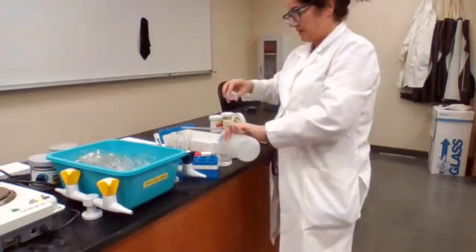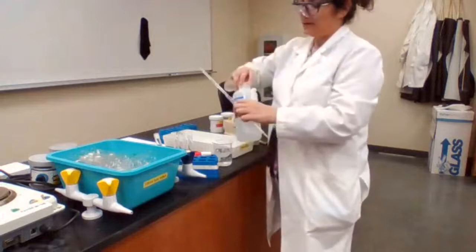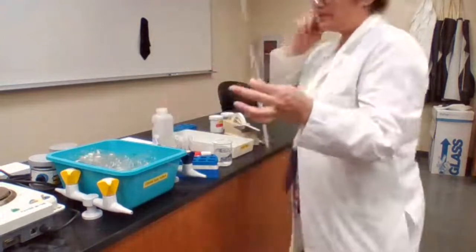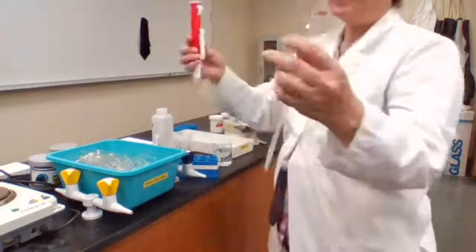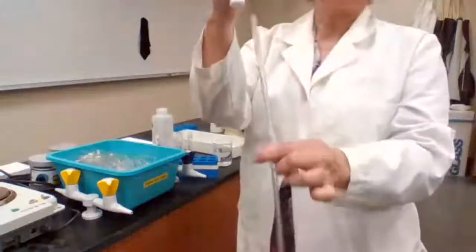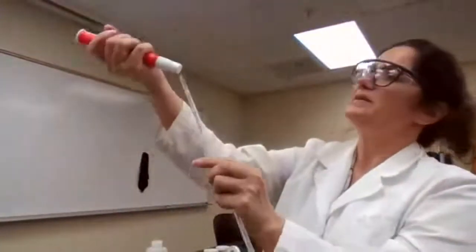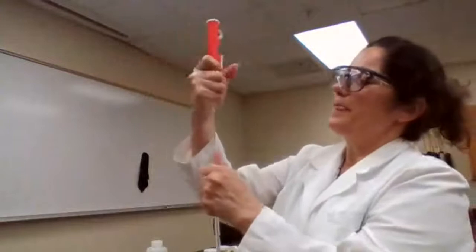So I'm going to use a pipette to measure exactly. This equipment is called a pipette, and this is the pipette pump. I insert the end of the pipette into the pipette pump.